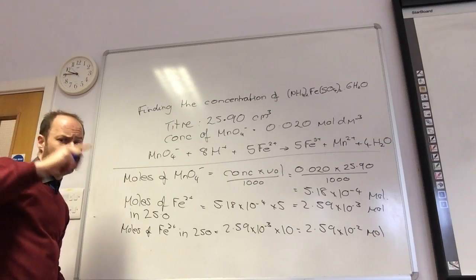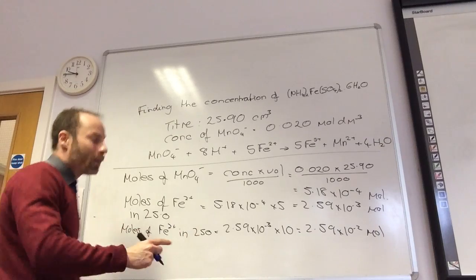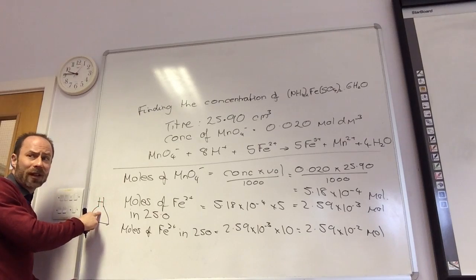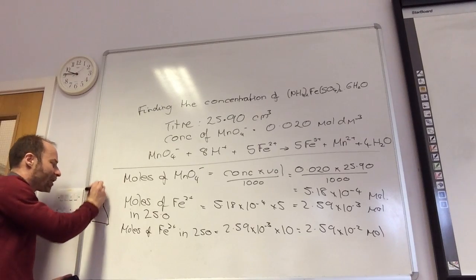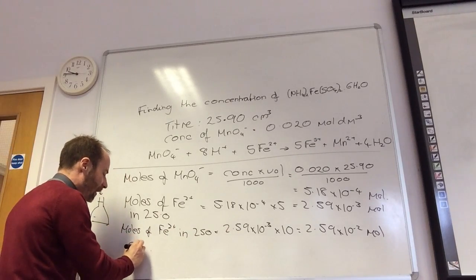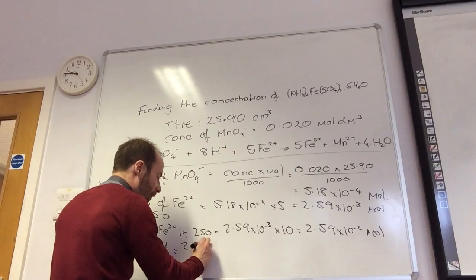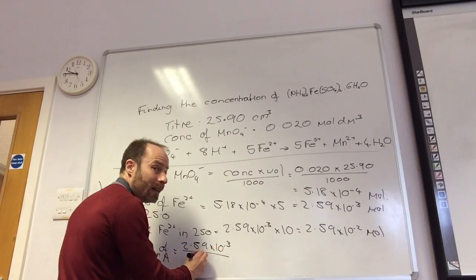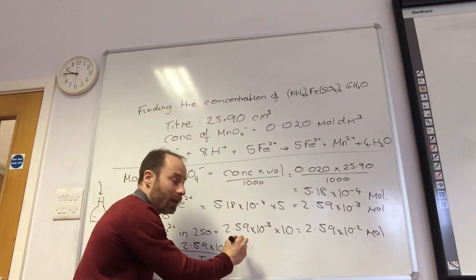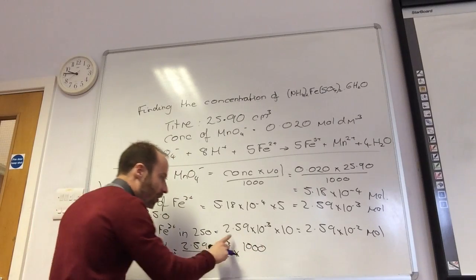Okay, this is now the tricky bit. That was the moles that were in my volumetric flask. I took 25 out. What, the original solution, how much did I add? That was in 50. So originally that number of moles was in 50. So my concentration of solution A is that number of moles, but that was originally in 50 that I took out with my burette, times by 1,000 to get it into moles per decimetre cubed. And it's 10 to the minus 2.